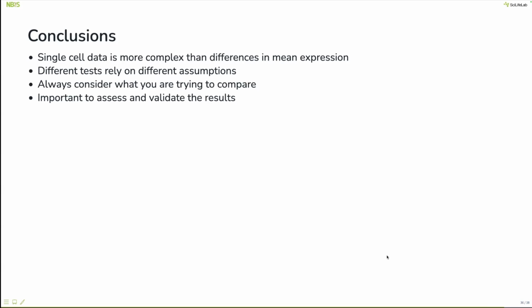I don't work with it much. SCT has nothing to do with ambient RNA. Okay, just to make sure that we're on the same page here. I mentioned in the lecture a few tools for removing ambient RNA. I would probably recommend Cellbender. That's the one I've used the most because it's less biased by clustering beforehand.